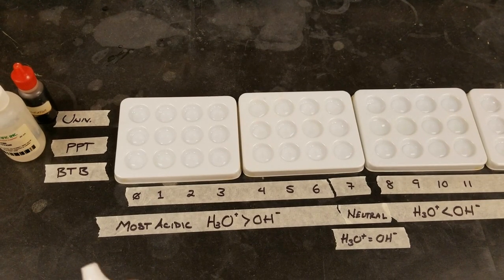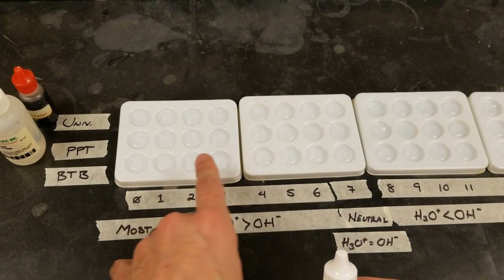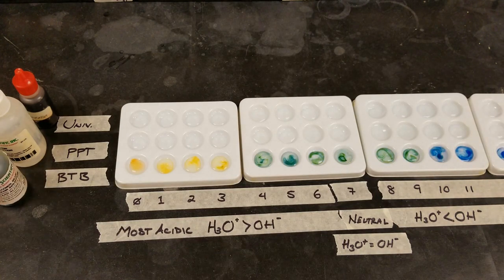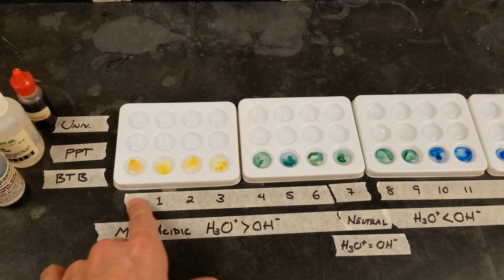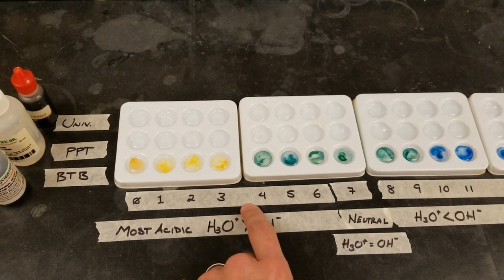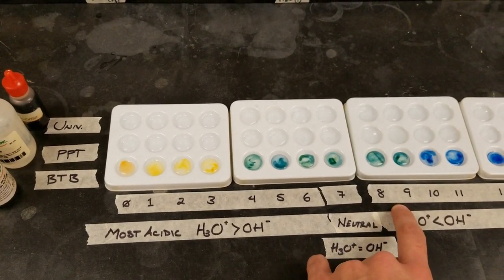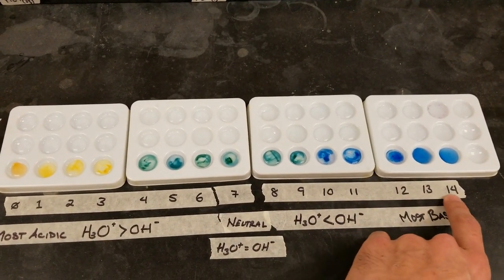So the next thing is to test the indicators. I'm going to start with bromothymol blue and add a drop to each of these going across. Now as you can see, in the most acidic solutions the BTB is a yellow color. In the intermediate but still acidic solutions through neutral and some of the slightly basic solutions it's green, and through the very basic solutions it is blue.